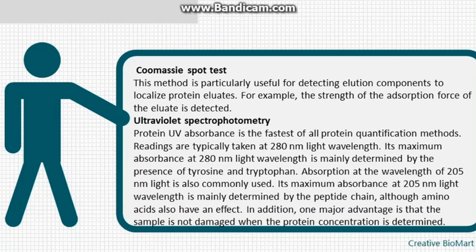Coomassie spot test. This method is particularly useful for detecting elution components to localize protein eluates. For example, the strength of the adsorption force of the eluate is detected.